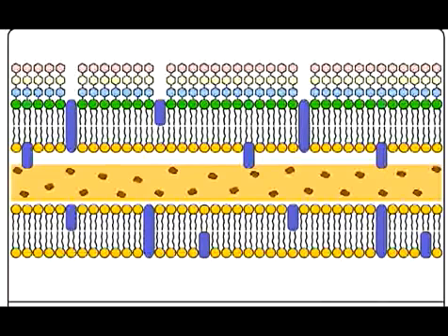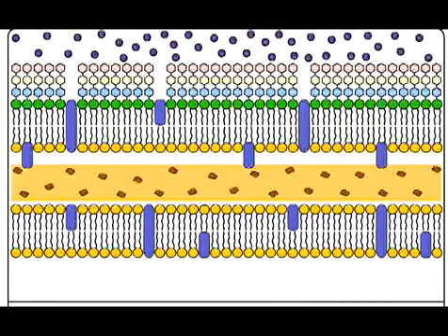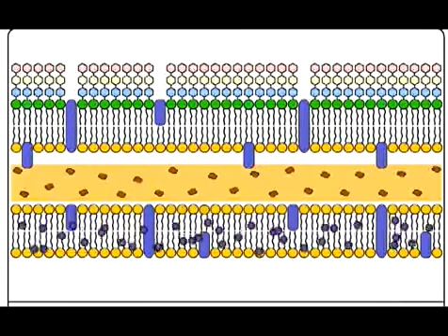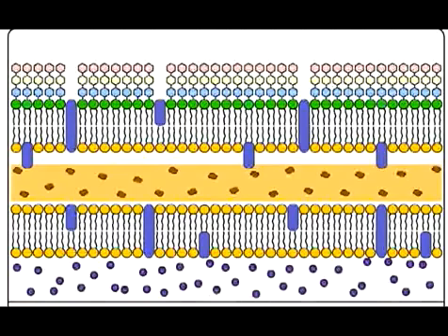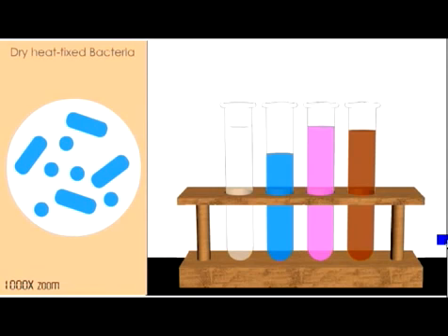In gram-negative bacteria, you'll notice that the peptidoglycan layer is much thinner and there is also an outer membrane. After the crystal violet sits for a minute, the cells are stained a bluish or purple color. We then give a quick rinse of water and move on to the next step.